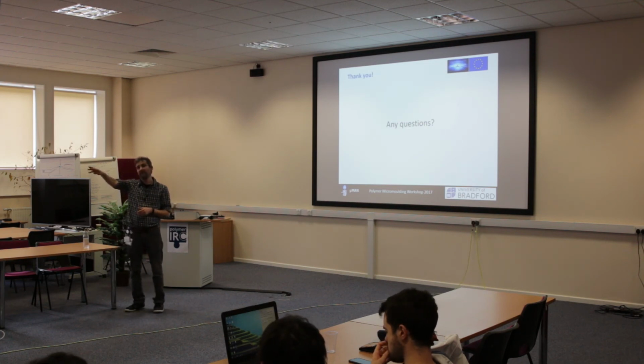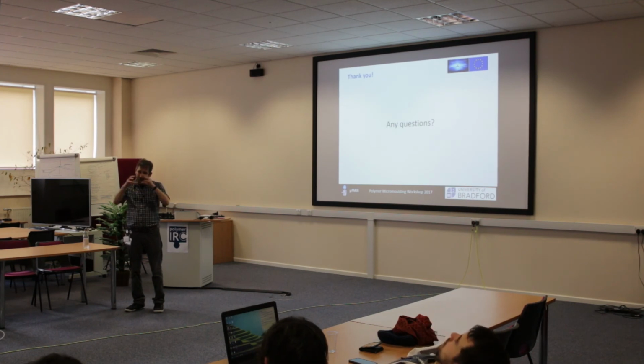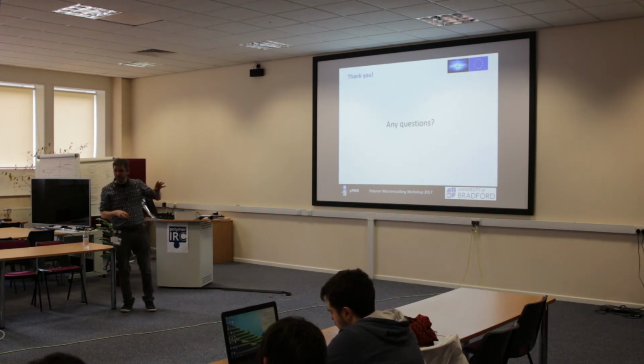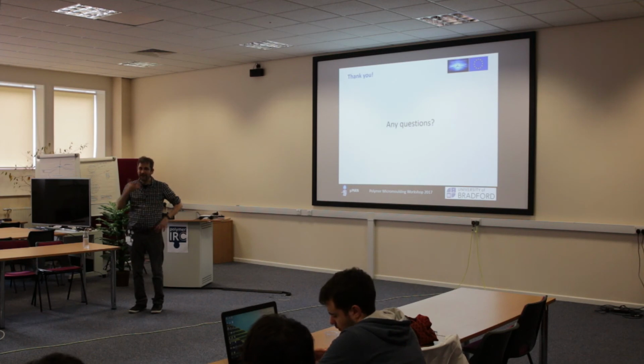We have a micro CT in there, which will give you a 3D scan of the inside of your material, but only to a resolution of about 1 micron. Any smaller components than that, you won't get with that, because for that you are flooding everything with X-rays. So if you want to flood everything with X-rays and get that massive resolution, then you need a synchrotron light source with a very big evacuated chamber with your sample shoved in the middle of it, basically. So again, it's a matter of exactly what the problem is.